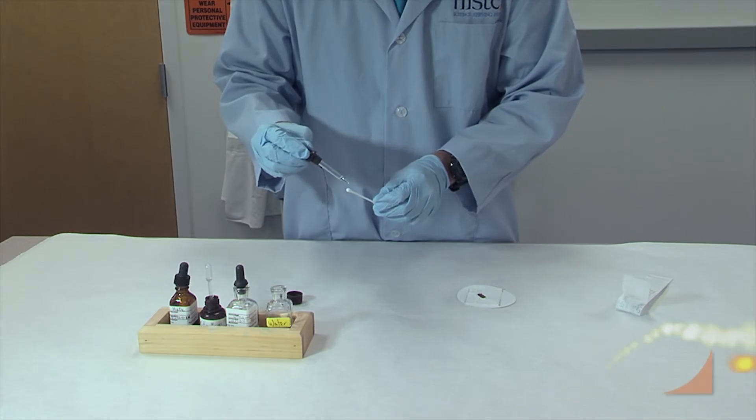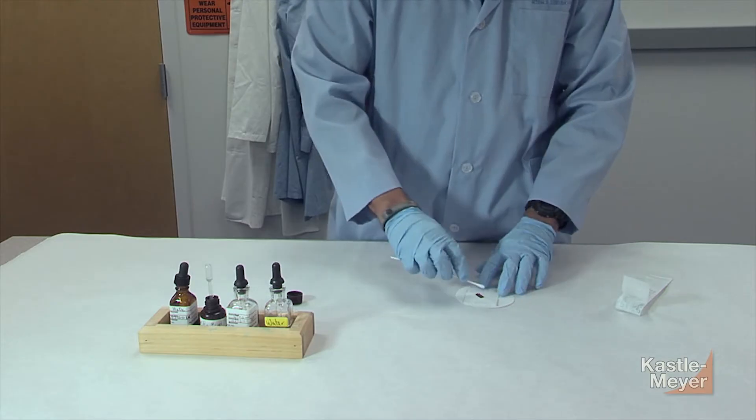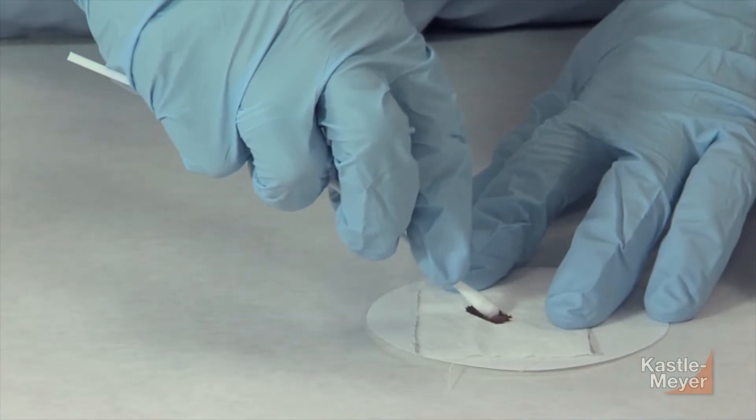First, take a sample of the blood stain to be tested by using a cotton swab or the corner of a piece of filter paper. Only a very small sample of the stain is needed for testing.